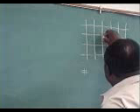And get your average. So you want to get the average of those 5 squares, then times 25 times 10,000, and that will give you the number of cells per milliliter. So if you go to this middle one, count 5 squares, get the average, multiply it times 25 times 10,000, that will give you the number of cells per milliliter.